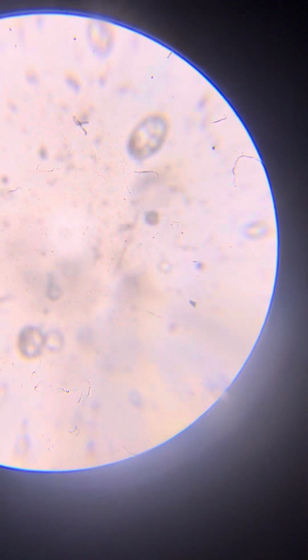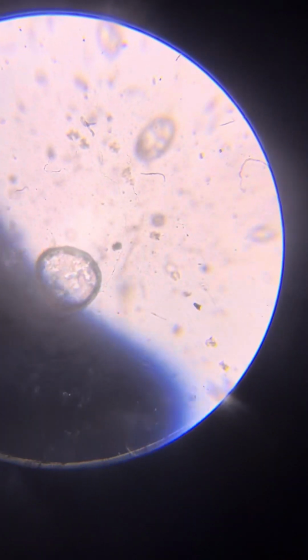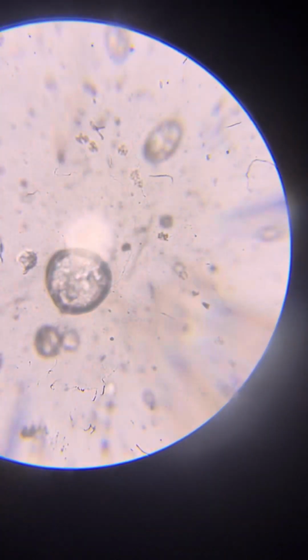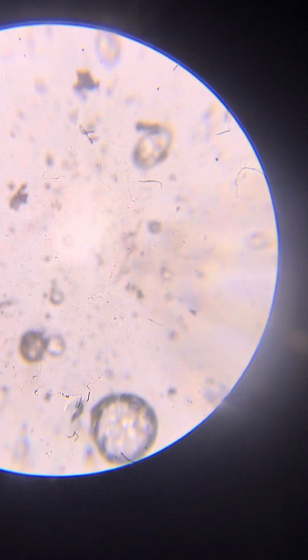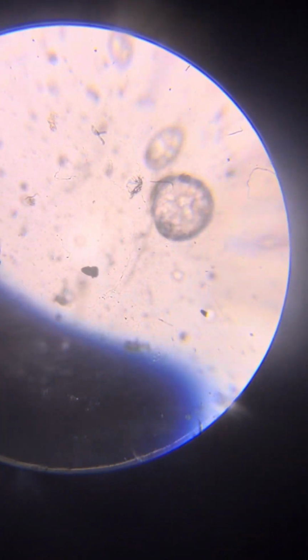Mostly it's happening in the 150 magnification, not in the 64 as you've seen. Okay, so this is only 150. Yes, so it mostly seems to be calibrated well. So it looks like in a Stargate position, which is very interesting.